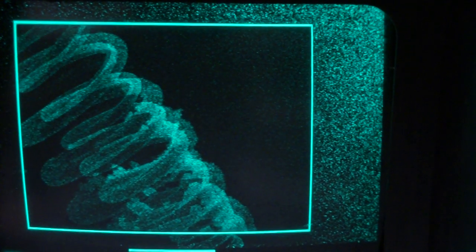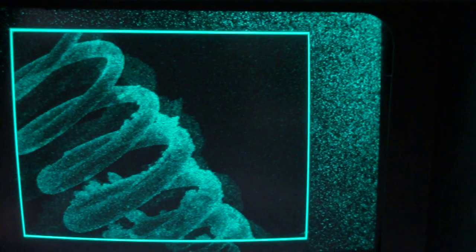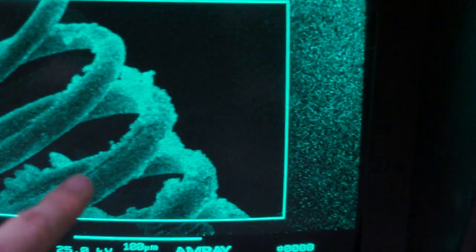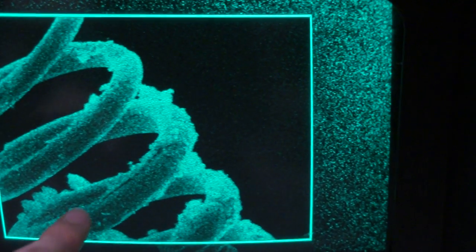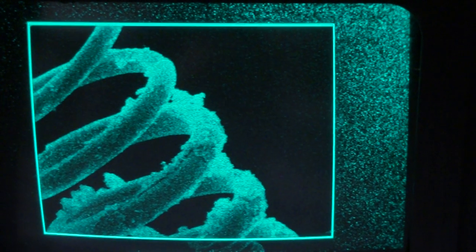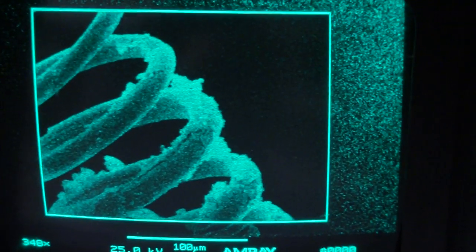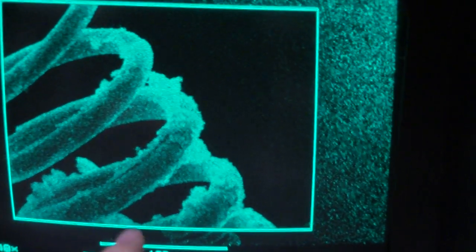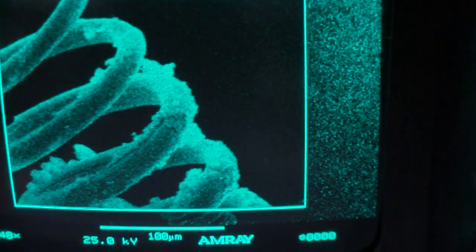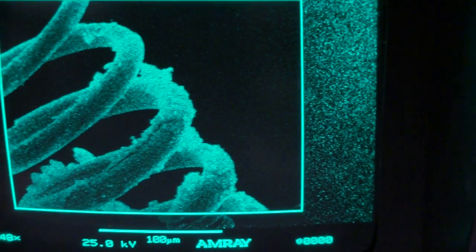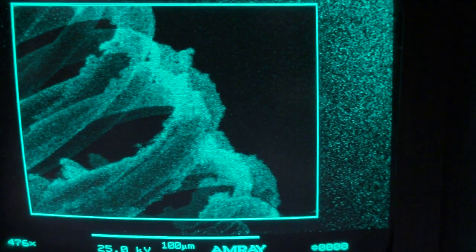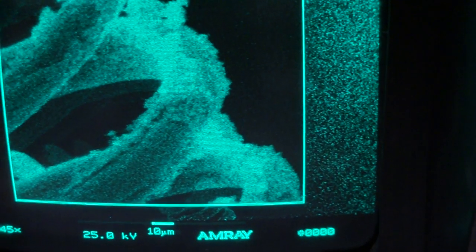Starting to see all the white fuzzy stuff. Well, it's not white on the screen because this is just a green screen monitor. Since we're imaging with electrons and not photons, there's no real color as we would think of it if we looked at it with our eyes. But if you had looked at this with your eyes, you would see white fuzzy stuff. That's this through here, and this is the filament through here. You can see a definite separation of the tungsten oxides versus the tungsten itself. So let's keep going in here. 645 times.